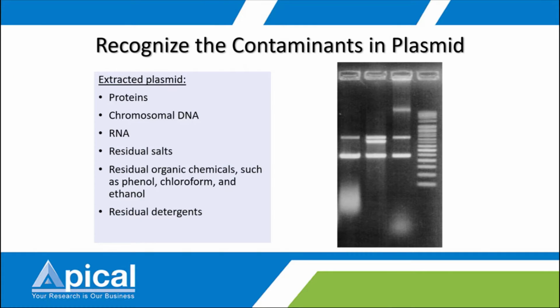How about plasmid? As I mentioned just now, plasmid should be pure, right? But sometimes after plasmid extraction, if you use too much cell, you may have protein contamination. You may still have RNA or chromosomal DNA inside your plasmid.